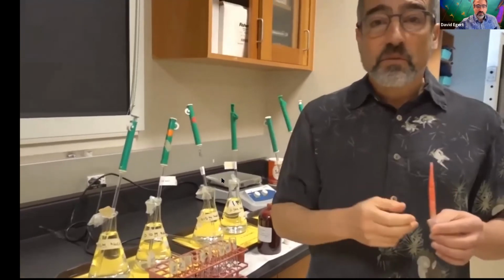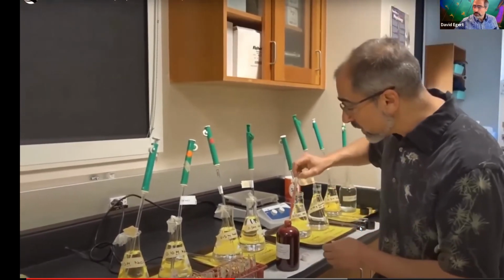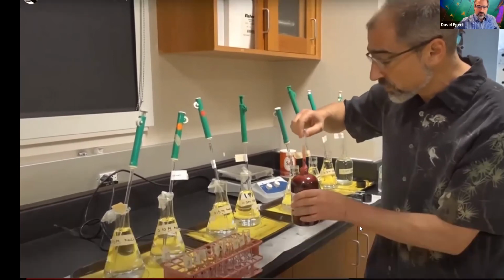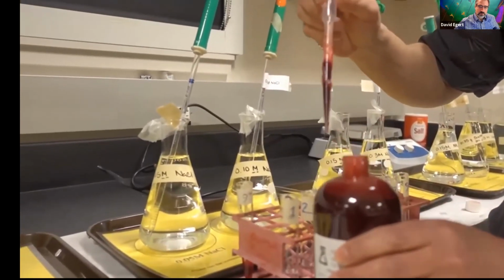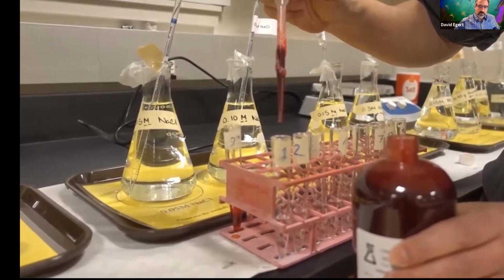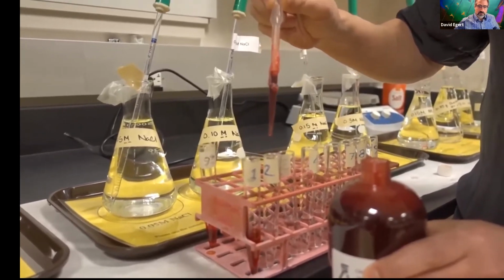Because we want to only vary the solutions, we want to make sure the amount of blood in each test tube is the same. So these drops, we try to make them as consistent as possible. It's going to be 6 drops, and it's not just around 6. I really want to do 6 well-formed drops. 1, 2, 3, 4, 5, 6.